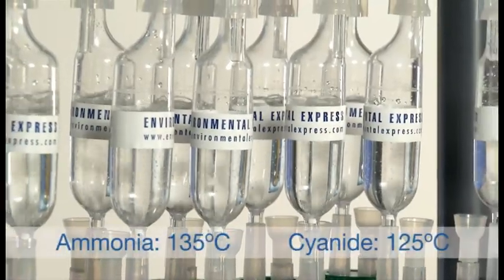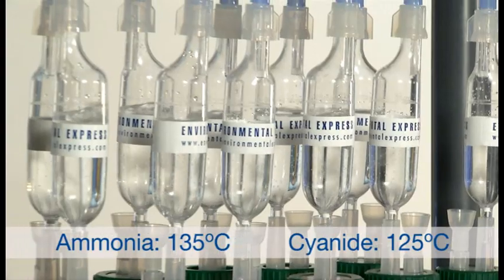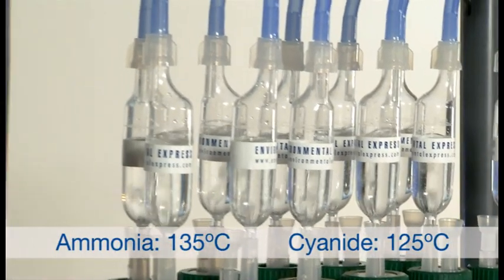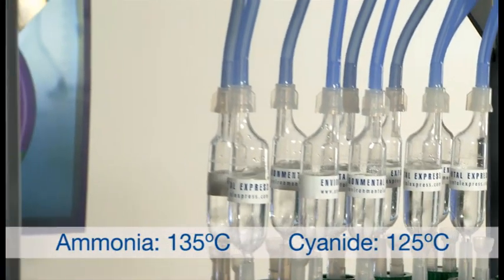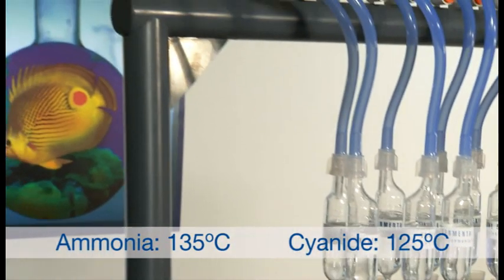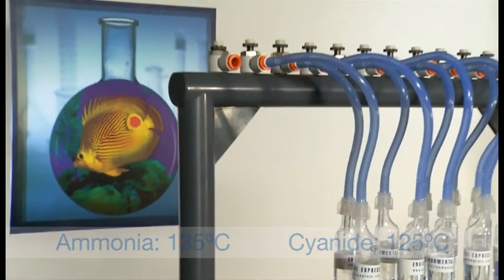The hot block should be heated to 125 degrees Celsius for cyanide distillations and 135 degrees Celsius for ammonia distillations. Once the temperature has been reached, the distillation process takes one hour.